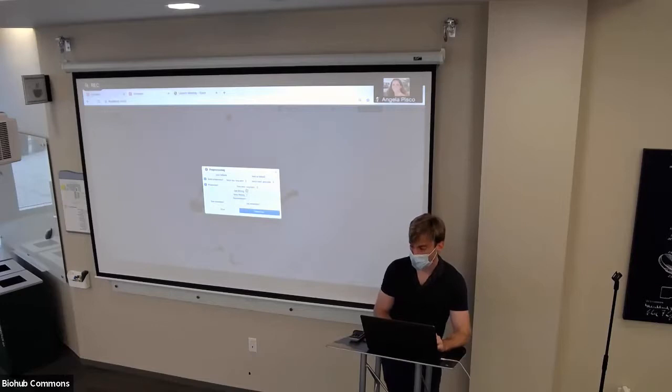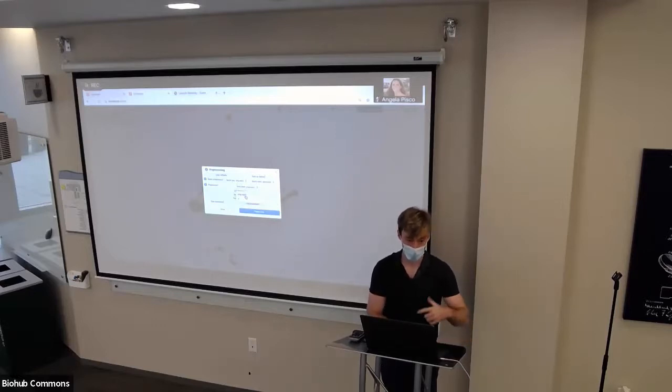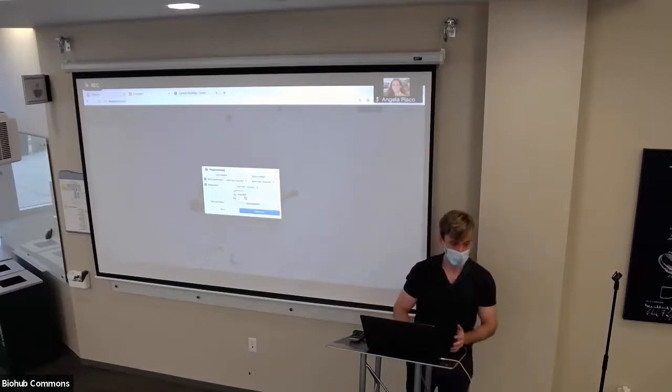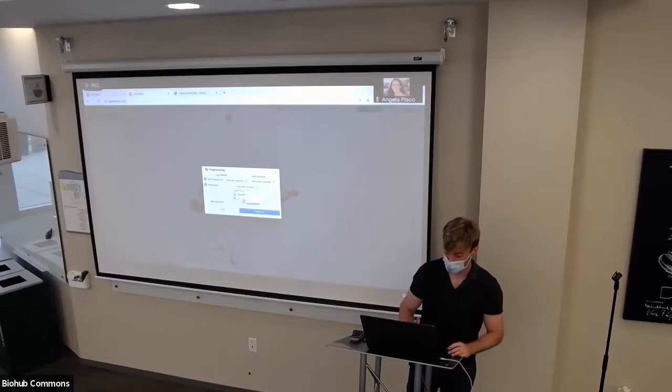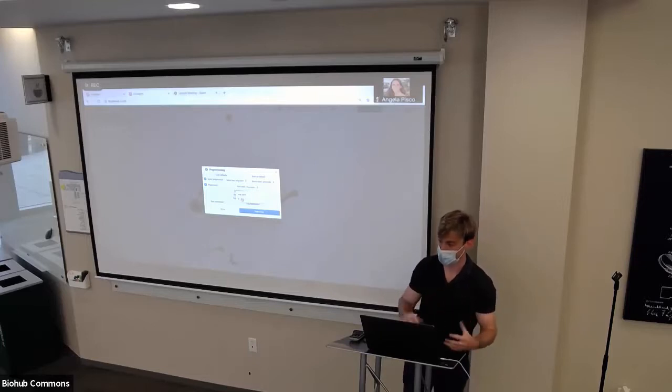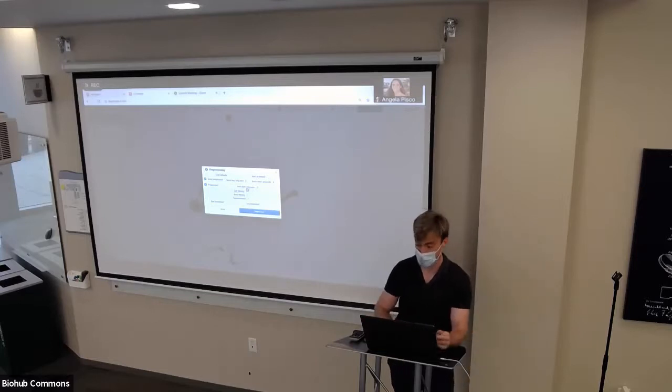The last thing is, let's say you want to pre-process your data. You've already done pre-processing, but you want to redo it. This is where orig.expressions comes into play, because this stores the raw data that you had when you loaded your data set. If you want to process further an already processed expression, maybe log it again for whatever reason, or do some things to it, you could choose X. X is adata.X, and it contains the most recently processed version of your data. But most often, you would just always want to pre-process from the initial starting point, because it doesn't make sense to double log your data or do some wacky stuff like that.